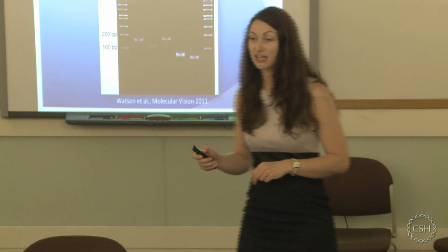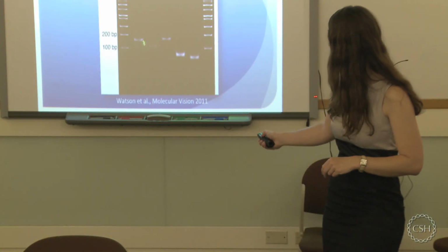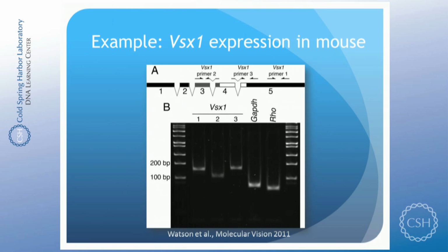They also run it on a gel afterwards. The three primer pairs, I hope you can see. There's one product, two, and three. So it's a single band. There's no primer dimers. It looks really clean. And same with the GAPDH and Rho primers as well.